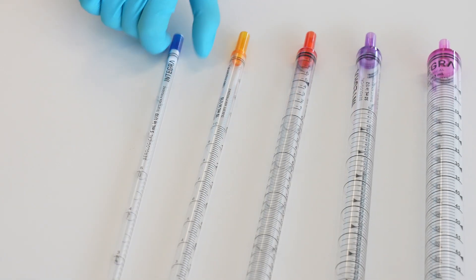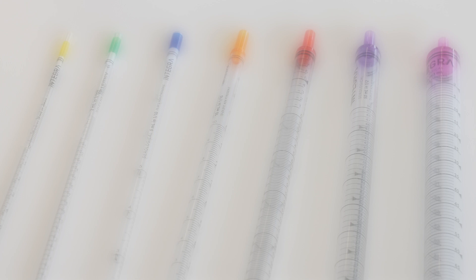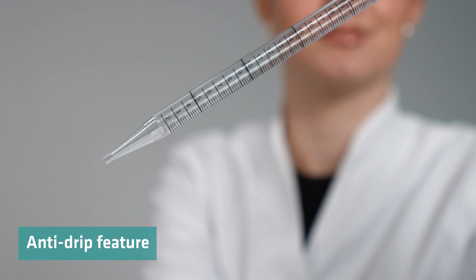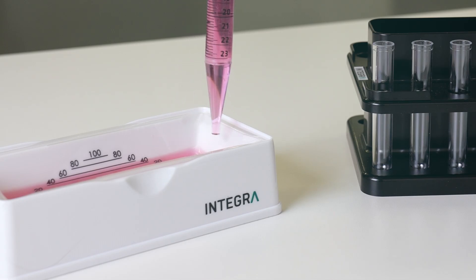To give you optimal control in the lab, we offer serological pipets as well. The Integra serological pipets are available in a broad volume range from 1 to 100 milliliters, including an innovative anti-drip feature for the larger volumes.